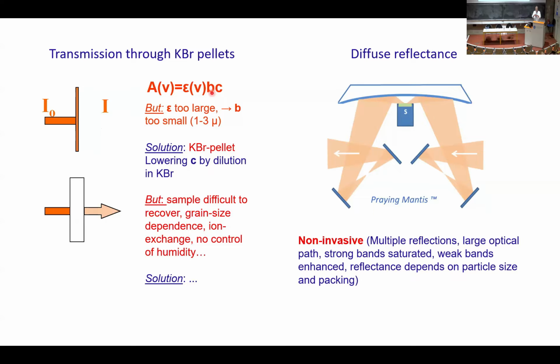And that happens for many samples and for many bonds, if you want, including the SiO and all the modes of water, especially the stretchy modes of water. All of them are critical to the study of clays. So this type of transmission is rather difficult to apply.